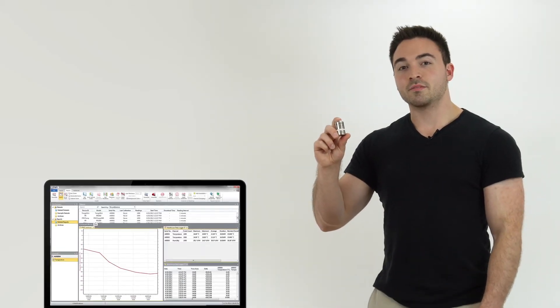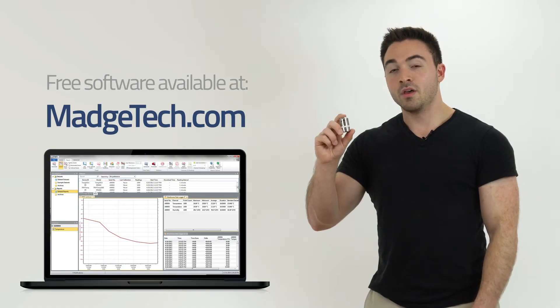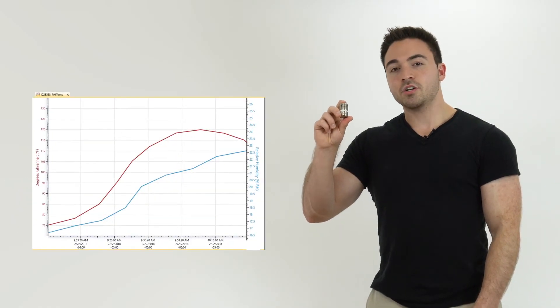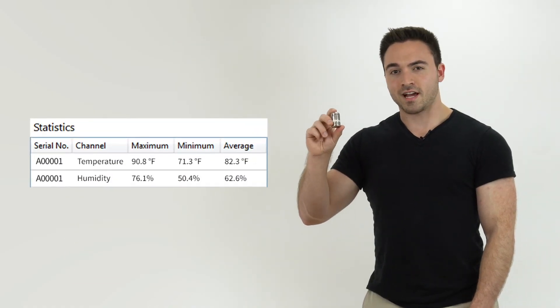The RHTemp1000IS can be connected to the MadgeTech software, which can be downloaded for free from MadgeTech.com. Within the software you can automatically generate graphs and data tables, as well as calculate a number of statistics for quick and easy analysis.